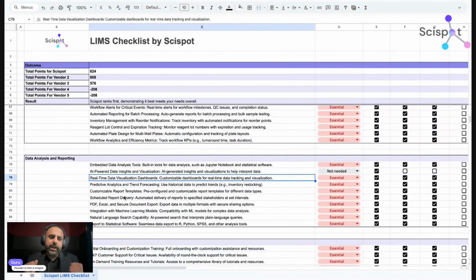When it comes to data analysis and reporting, there are very specialized needs based on the type of instrument you use. If your assay is more qPCR or a next-gen sequencing machine, how do you want to bring the data in? Obviously, you don't want to store the raw data. You want to transform it. You only want to turn it selectively into a tabular format. You want to analyze CT value in qPCR cases, and variability in sequencing. You want to do the QC before you process the sample and after you process the sample, so you want to detect those things automatically.